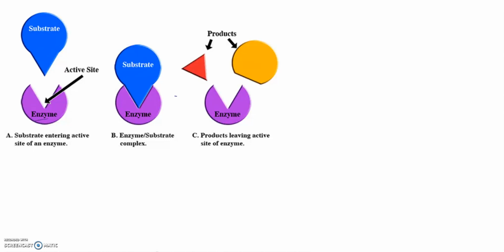So let's take a minute and review the enzymes lab that we did this semester. So first thing we want to recall is that an enzyme is a protein, okay? And remember that proteins are made up of amino acids. And as we'll talk about a little bit later in our review for this lab exam, every protein is essentially instructed for by a gene, right?